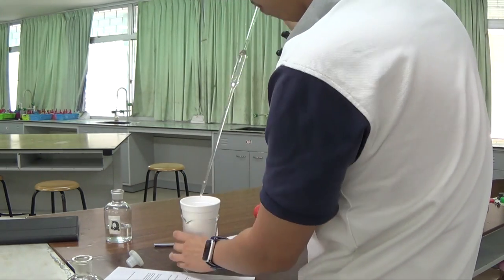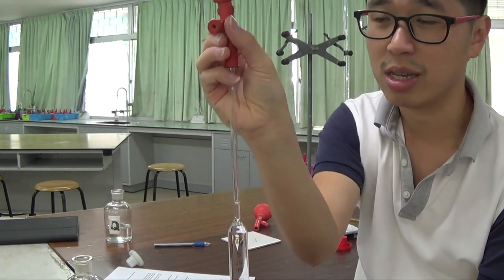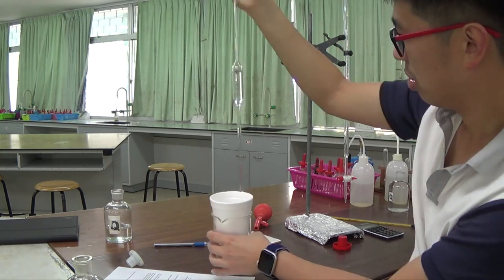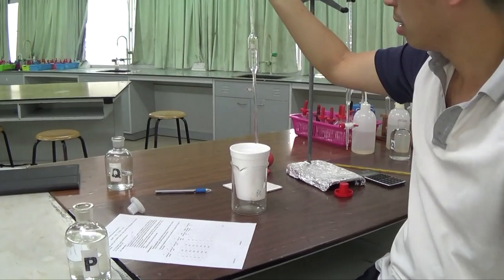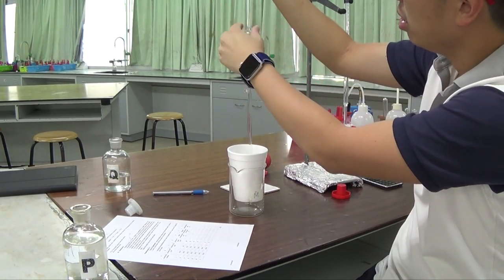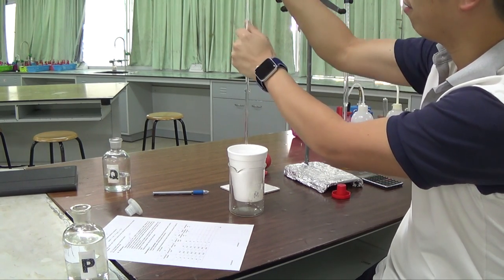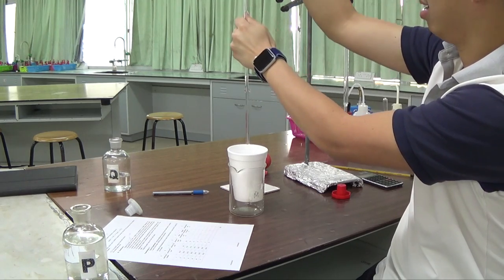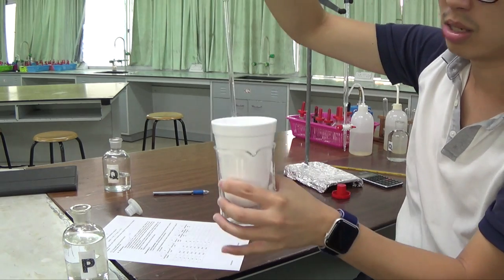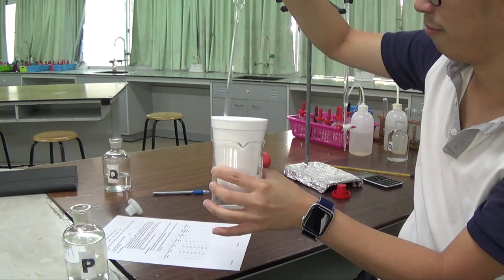So I put it into the plastic cup. What I'm going to do then is press eject E, and then it will be ejected. I don't want to hold it too high, so it's slowly being ejected. It is slow because if you keep on pressing E, you can just slowly twist your pipette filler, and then make sure you don't lose anything. And then it's so much faster now because it's no longer under the pipette filler.